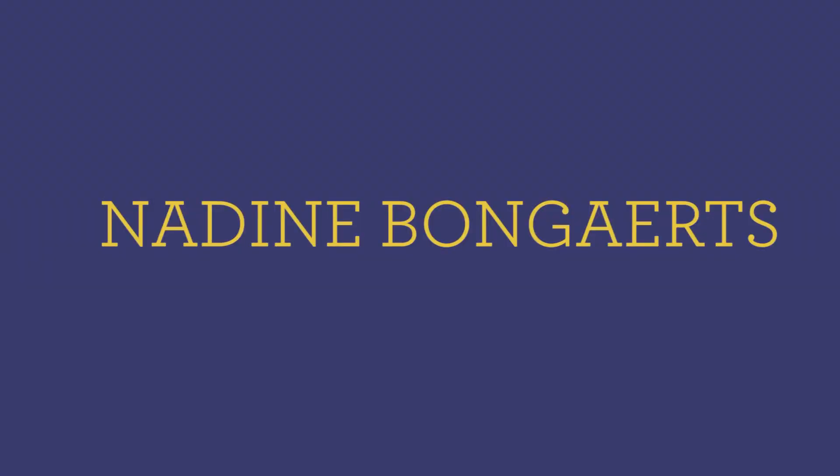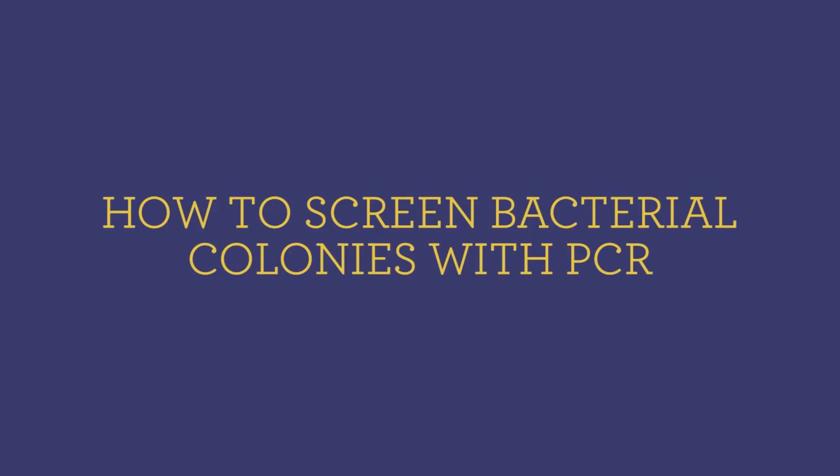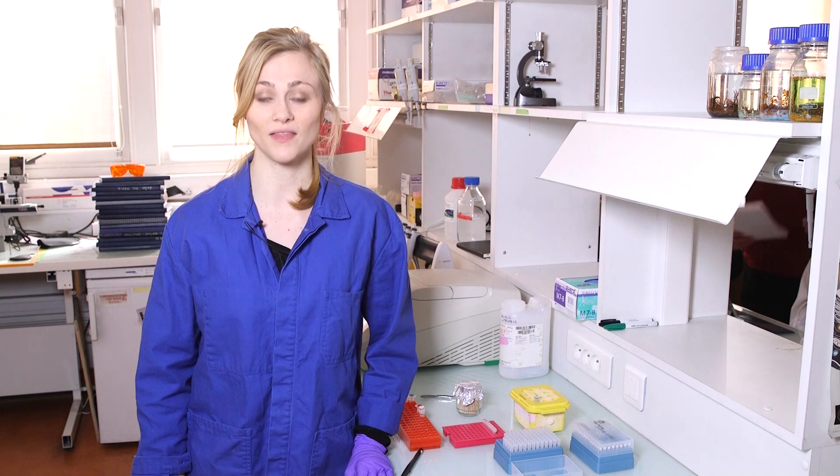Hello everyone, welcome back to Synthetic Biology 1. Today it's time for some Colony PCR. Colony PCR is a very useful technique to amplify any type of specific sequence on either the DNA of the genome of a bacteria or a plasmid. Yesterday I transformed my bacteria with a plasmid, and now I want to use Colony PCR to check if the plasmid is actually there.